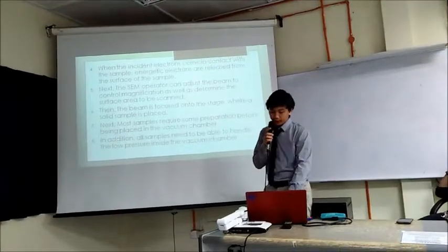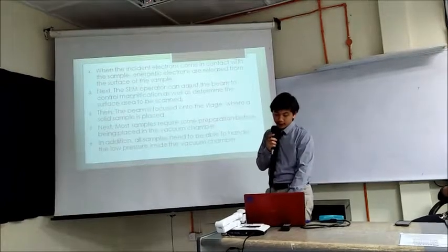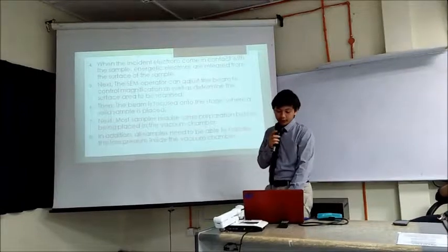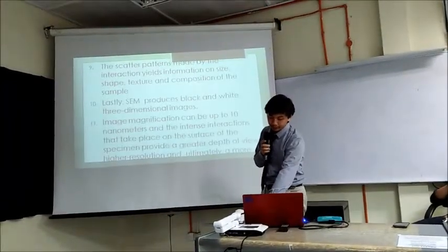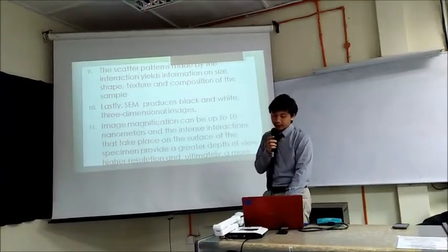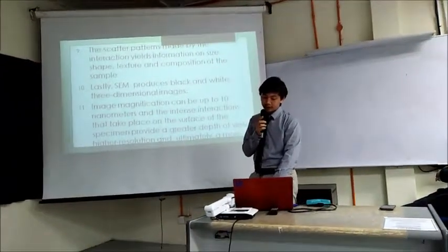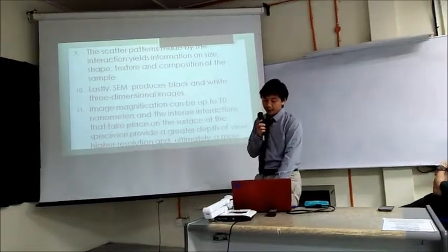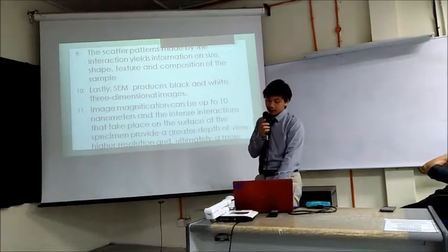Next, most samples require some preparation before being placed in the vacuum chamber. In addition, all samples need to be able to handle the low pressure inside the vacuum chamber. The scatter pattern made by the interaction yields information on the size, shape, texture, and composition of the sample. Lastly, SEM produces a black and white three-dimensional image.